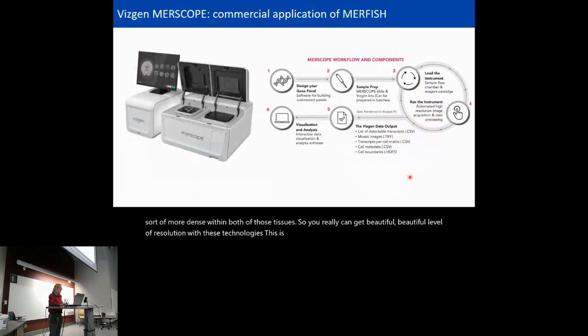This is the commercial application of this, the MERScope. The company does require that each individual person design their own gene panel. There are no pre-designed panels available. They expect you to go in, design the panel that you're interested in, and then go through the processing of that.